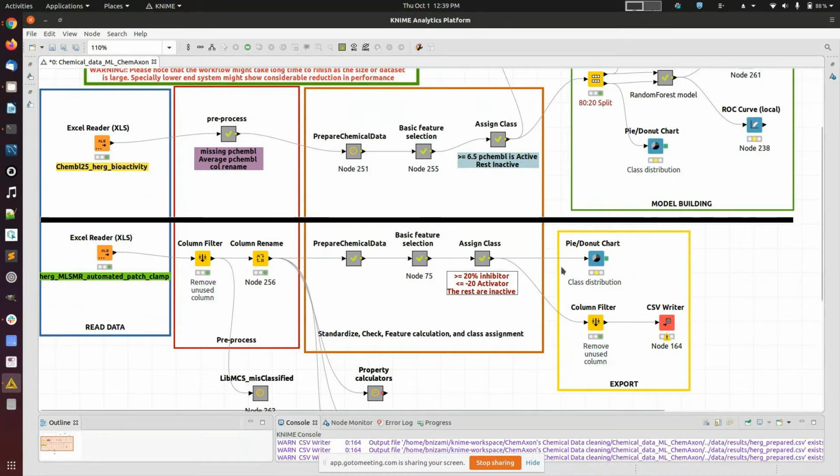Because executing only this lower part takes around 20 to 25 minutes on my computer with 16 GB RAM, and the model training takes several hours if you do not have a high enough computer given the size of the data. So we will not be doing that, but I encourage you to run through them in your free time. If you have any problem or question, you can definitely reach back to us.